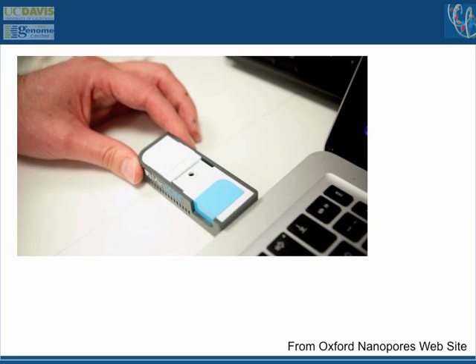So, this thing may win out in the coolness factor and in speed and turnover time. And the other, if this works, there's no startup cost. You buy this, it's $900. You don't need a $500,000 sequencing machine. That's it. You're done, is their claim. So this is the first real democratization of sequencing, if it works.